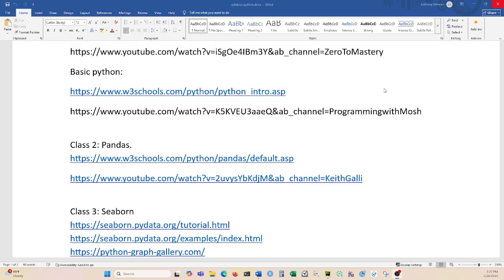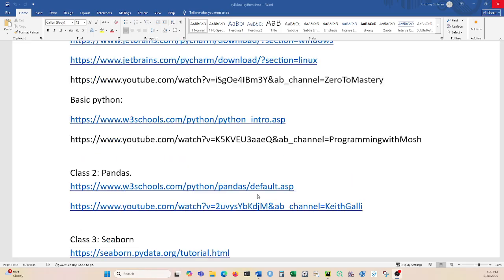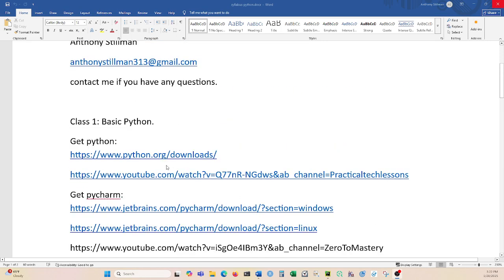All right. Now let's get into the class. So first part we're going to do is, let's get a copy of this.